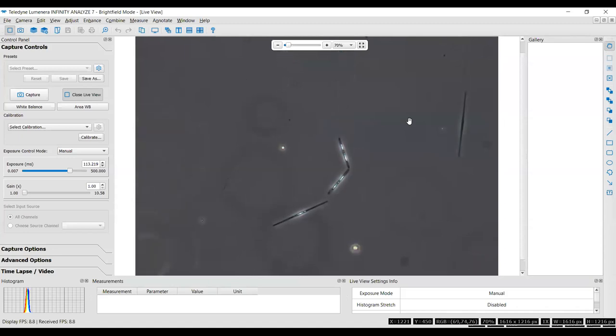Okay. So this is a southwest eutrophic lake. A few things to notice. We're going to look at quite a few taxa here. But this is Nitzschia, and it often does this really confounding thing, which you think would be species specific, but is not. Synedra does the same thing, or Fragilaria does the same thing. They'll form these stellate colonies. It is a growth form. It drives me crazy because you would think that would help you with the ID, but it just doesn't.